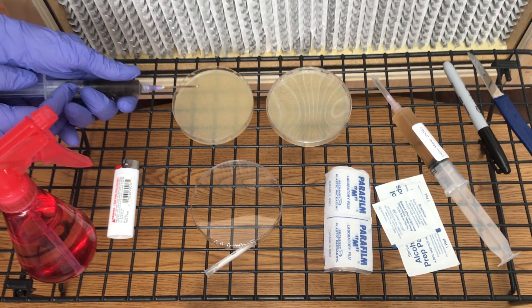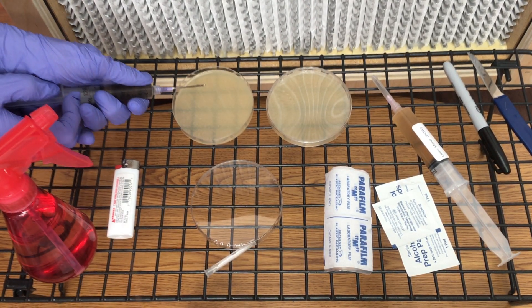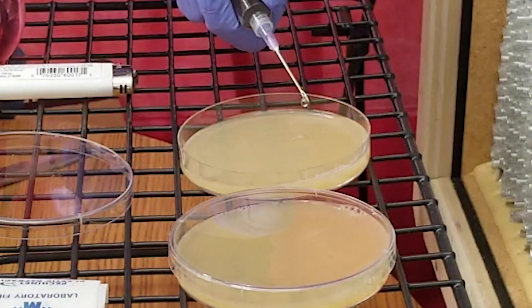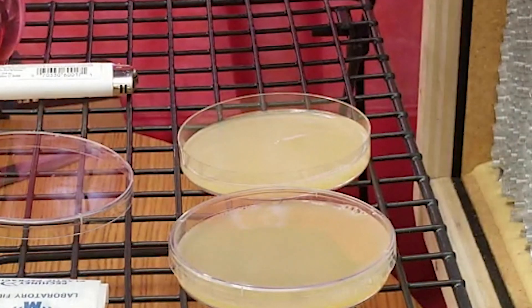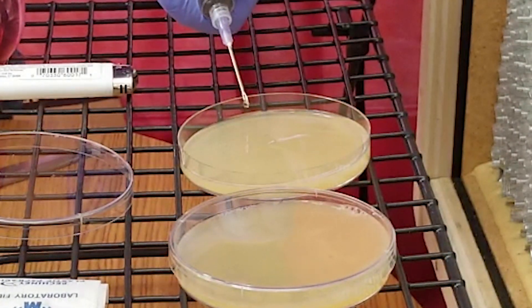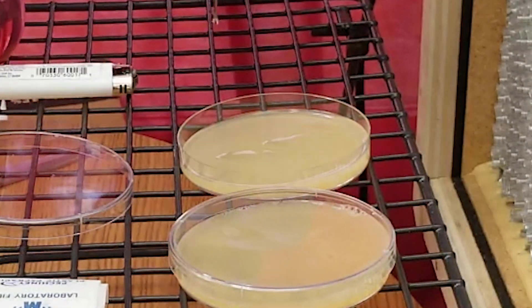Shake the syringe one last time and then squirt a few drops of spores onto the agar. You don't need that much spores, just a few drops will do, but I do like to be able to see a few specks of spores on the agar.